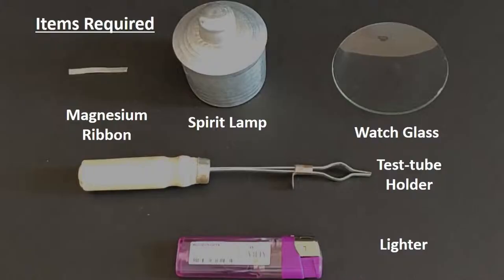For this we need a 1 inch piece of magnesium ribbon or strip, a spirit lamp, a test tube holder, and a lighter or matchstick to light the spirit lamp.